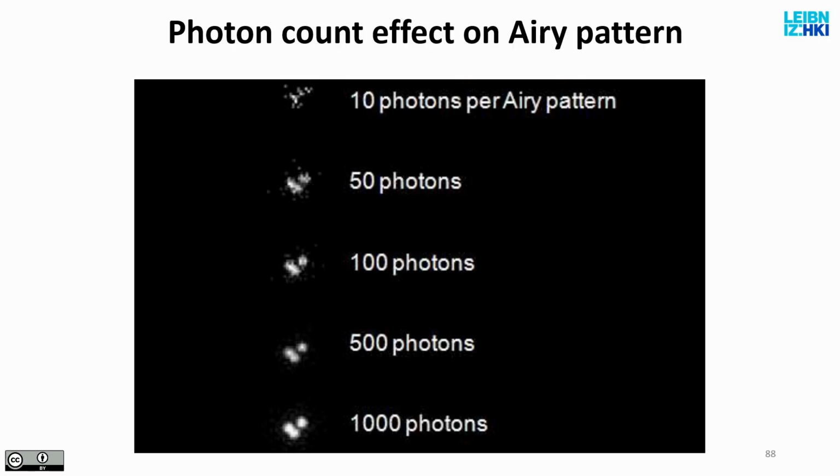And one more word about the importance of not closing the pinhole too much. The reason is that no matter what your optical resolution is, no matter how good your system is, if your detector doesn't get a certain number of photons, you will not get an image that is reflective of the actual resolution. We need, as a rule of thumb, approximately 500 to 1,000 photons per object, for example, per molecule, before we can really reconstruct the image at a quality that matches the optical analog resolution of the microscope.